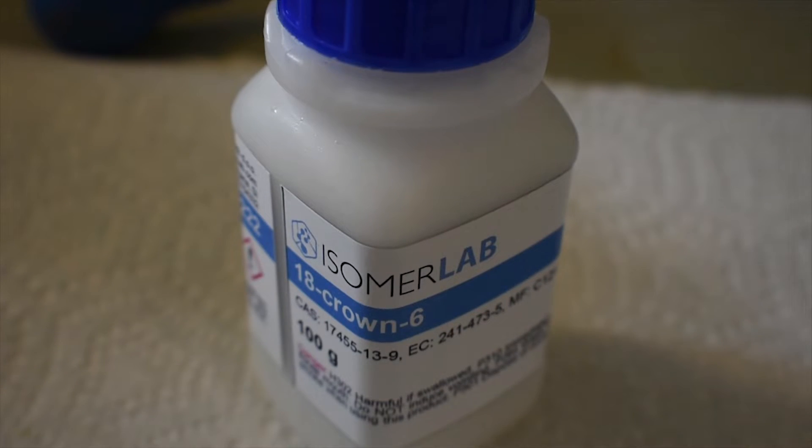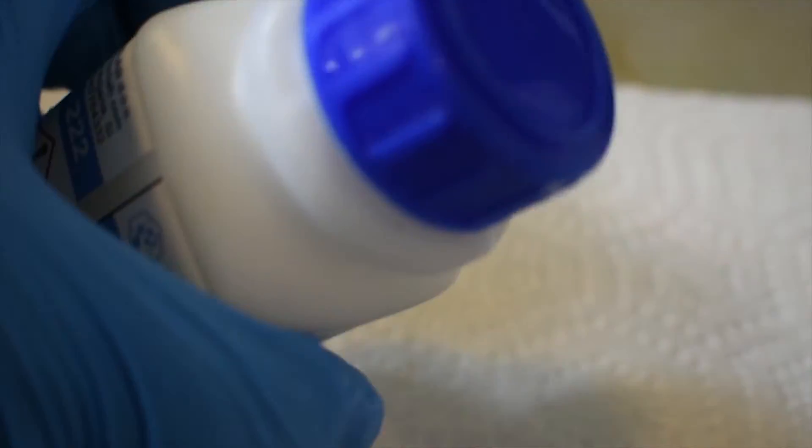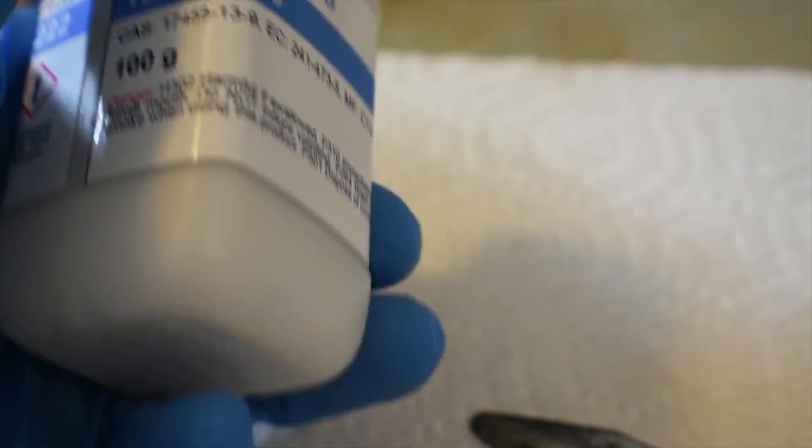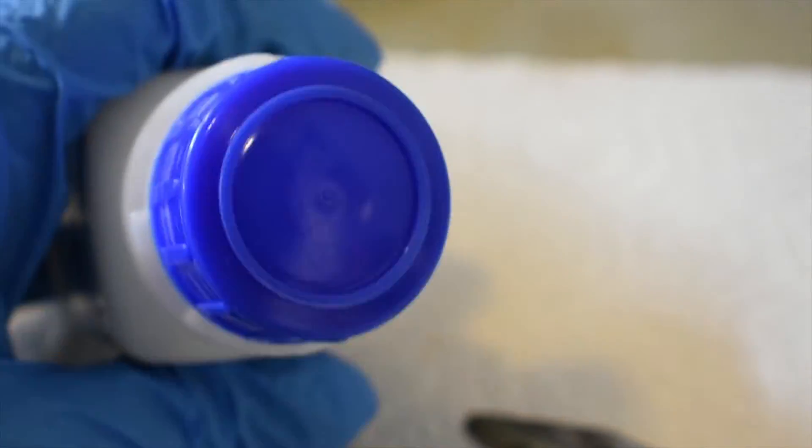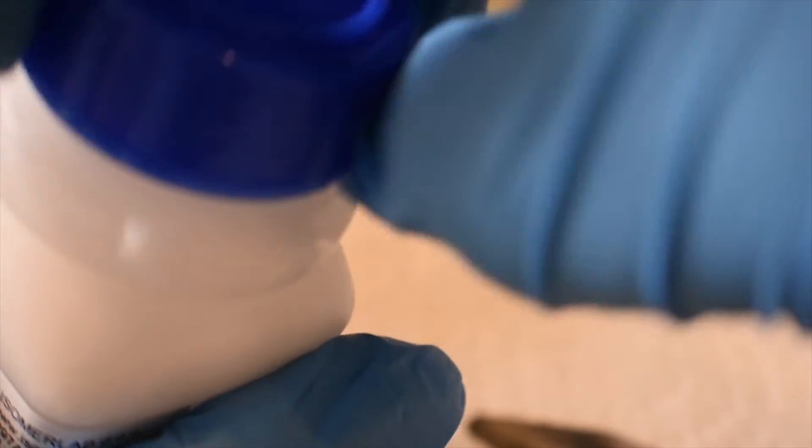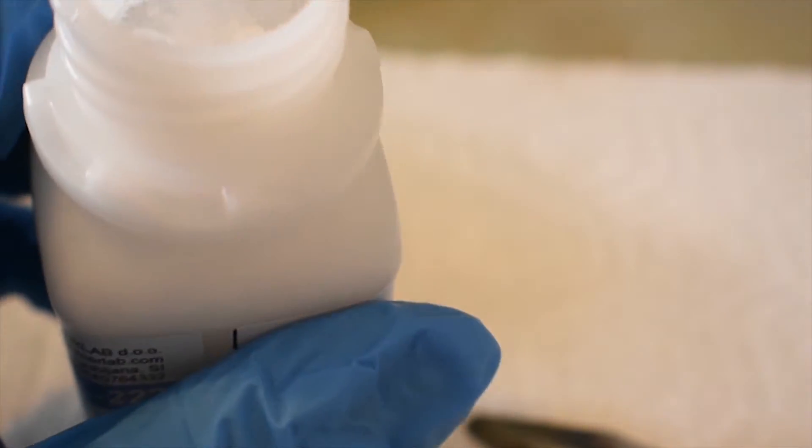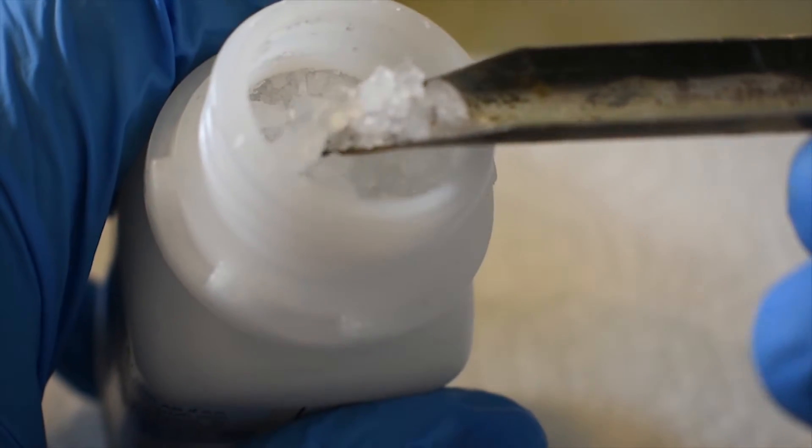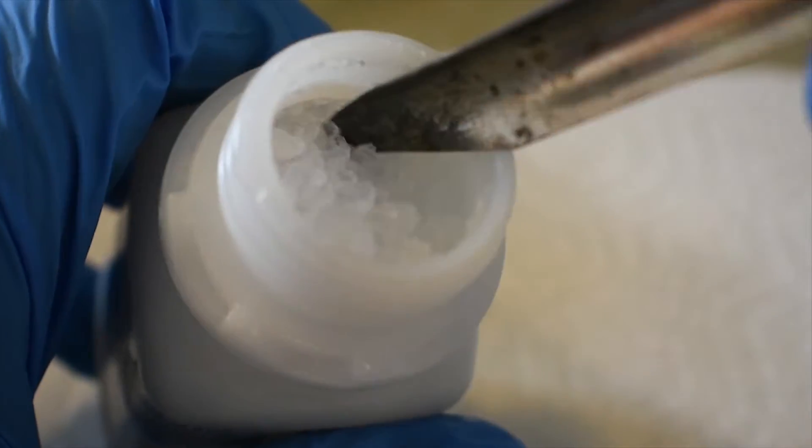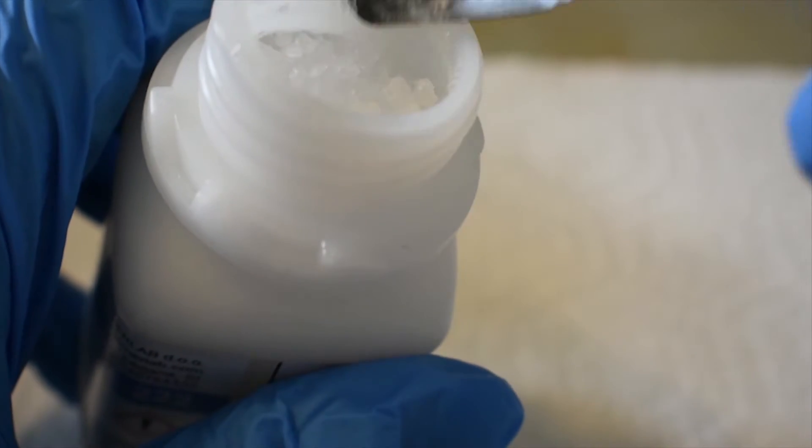To the chloroform we're going to add this. This is our 18-crown-6, our crown ether. Now for about 100 grams, this cost me about $66, which is a pretty good deal in my opinion. So 18-crown-6 is a colorless, crystalline solid that is very hygroscopic and will absorb water from the air. It's pretty nice-looking, actually.